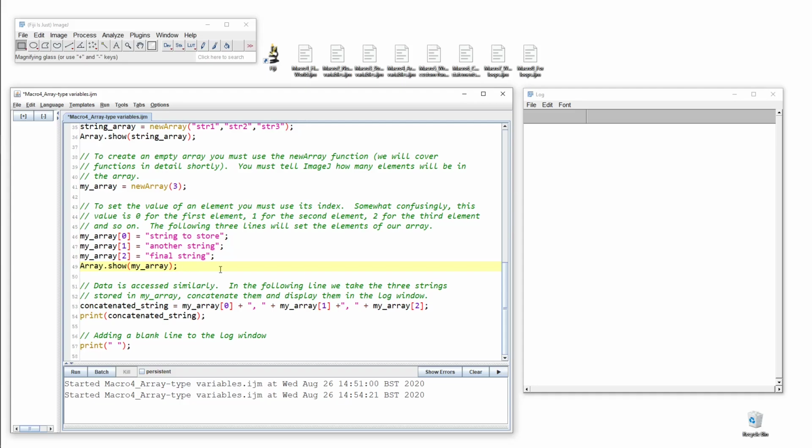But it's really just getting you familiar with the fundamental concepts of dealing with different types of variables and different types of arrays, because these are going to be useful when we're actually doing image analysis in the second part, when you're working with Dom in the second video, going through the worksheet and the macros that he's prepared. So let's give this a run now.